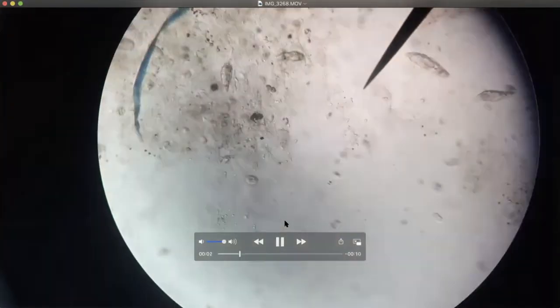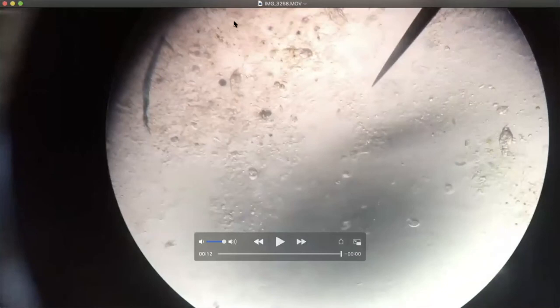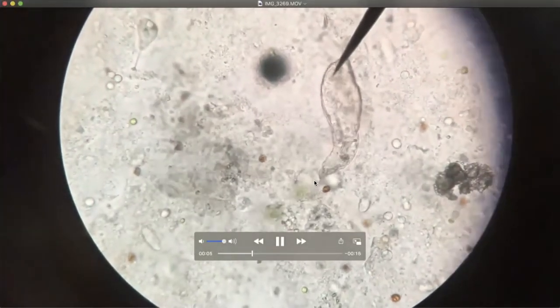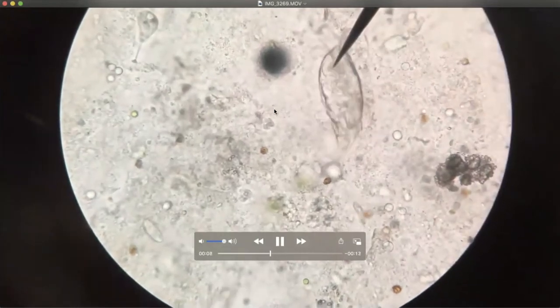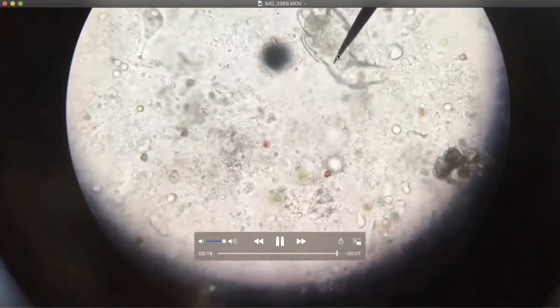Here you're able to see some of the protists we found in the aquarium under medium power. We have an example of a paramecium and what looks like a euglena. These very tiny organisms are bacteria — they do not have a nucleus inside of them. All the other larger organisms are eukaryotic and do have a nucleus. This is also an example of a nematode, a tiny little worm, which you can see moving around and munching on algae — you can actually watch food particles pass through its intestines.